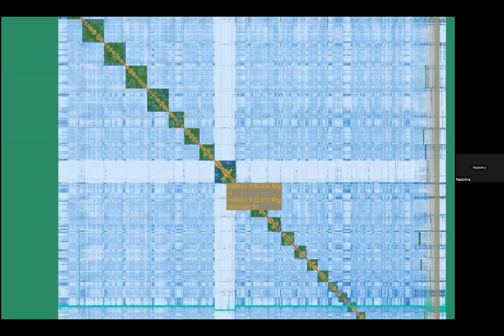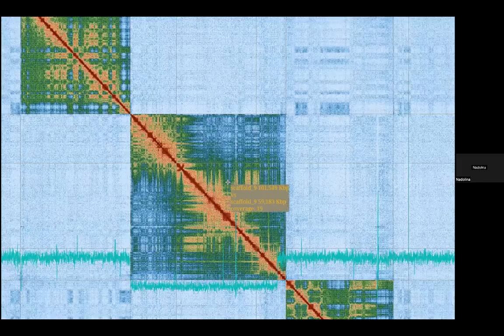So if you generate coverage, which I do with GenomeCov, and generate I think it's a bed graph format, from that, you can inject it into this pretext map so that you can actually see it in pretext view. It can be a little bit difficult to see with this color, but I'm hoping on the screen it comes through clear enough. It's clear, yeah. Okay, great. So you can see it down here.